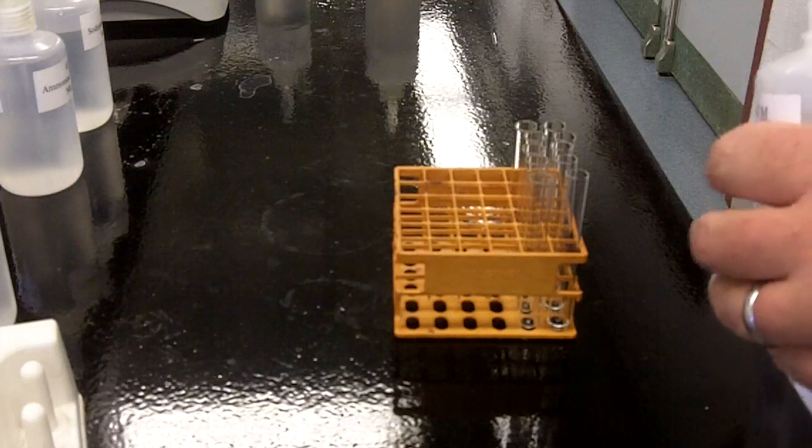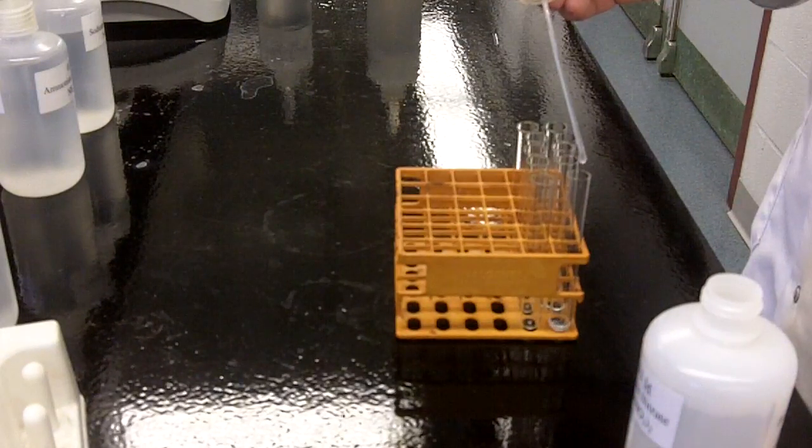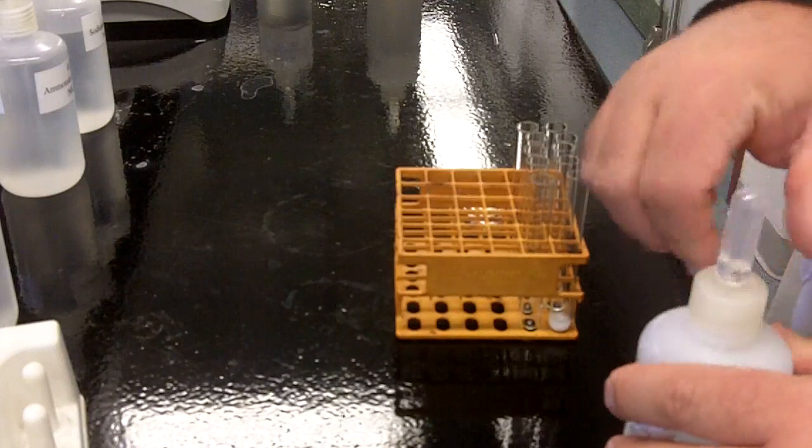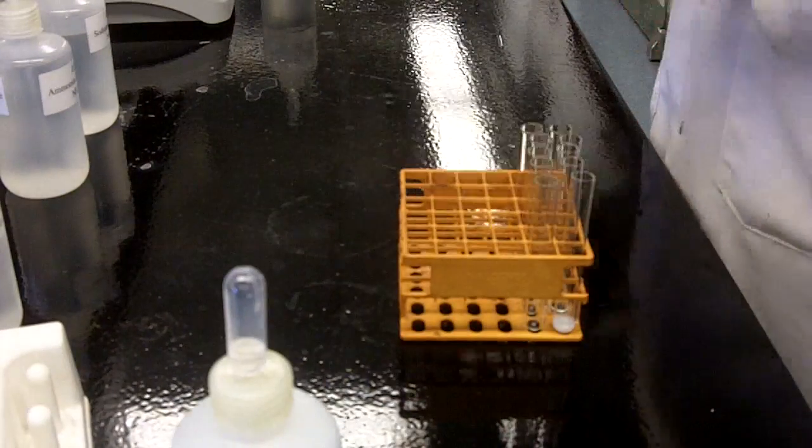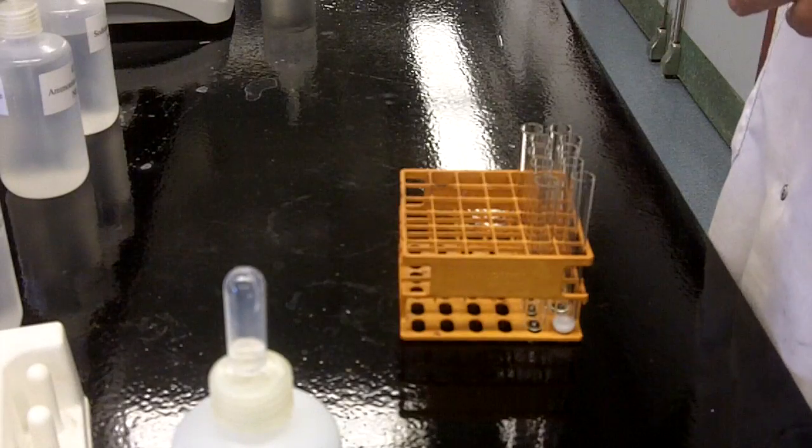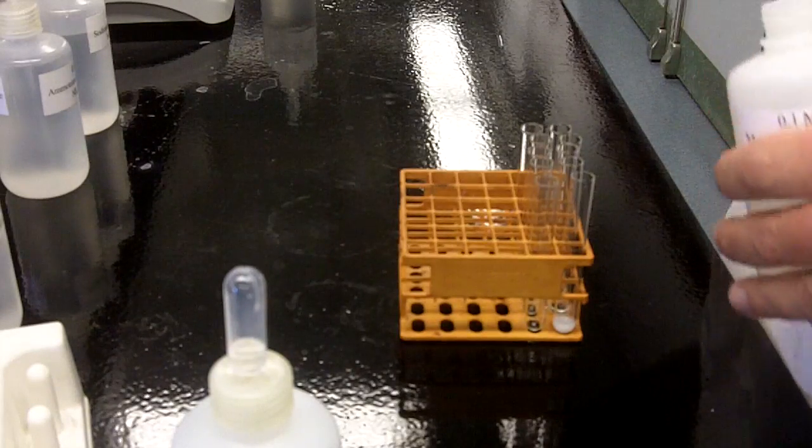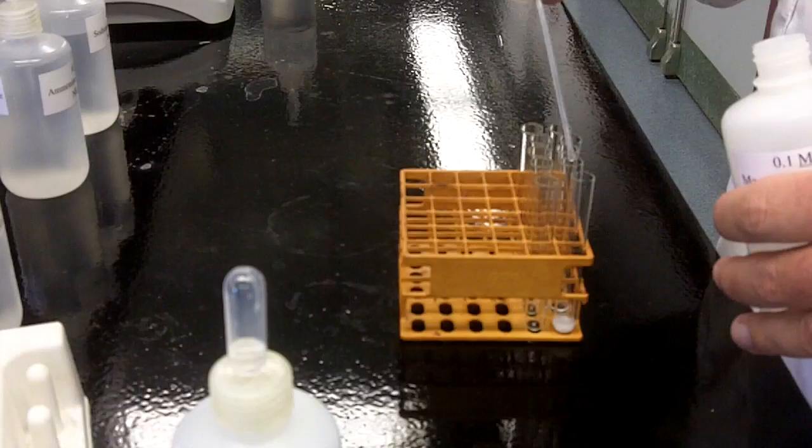Some of these will be very easy to identify - that one obviously is forming a precipitate - but especially with the ammonia and with the hydroxide, you're going to want to make some observations along the way. Here I'm just adding all five of them now.